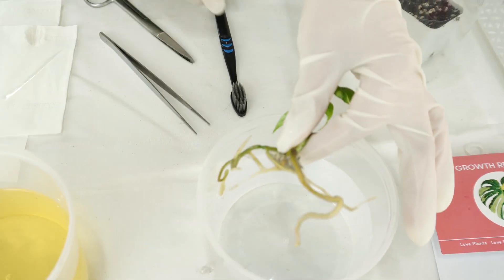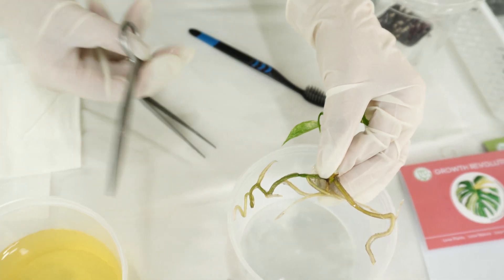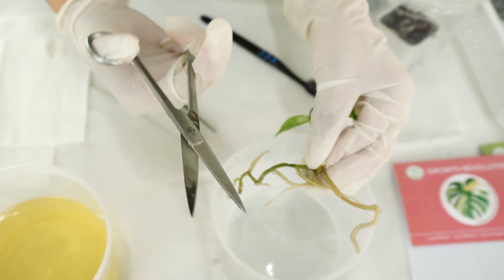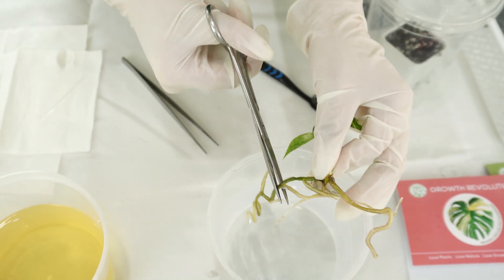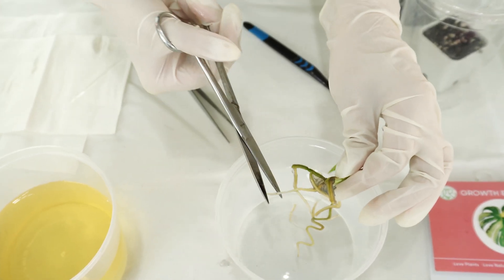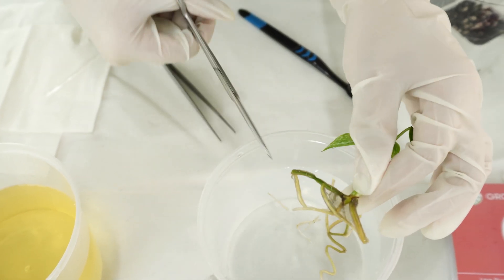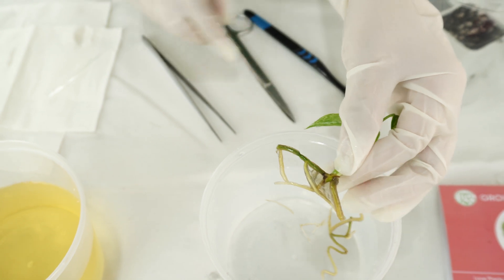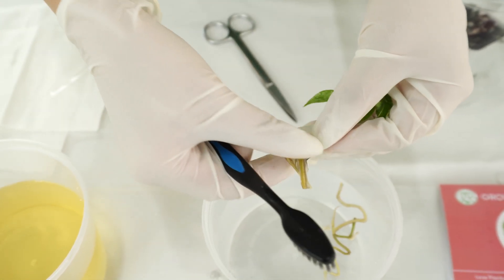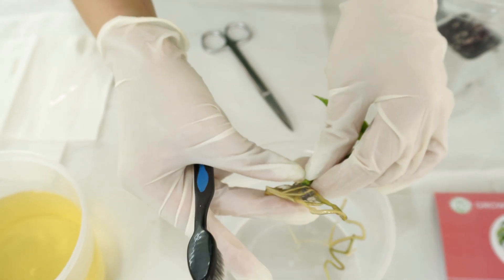We're going to trim the roots a little bit. Don't worry about trimming the roots — it's not a bad thing to do because it encourages the plants to regrow their roots. It also makes it easier to clean the plants and to put them into the soil mix or into the pot.